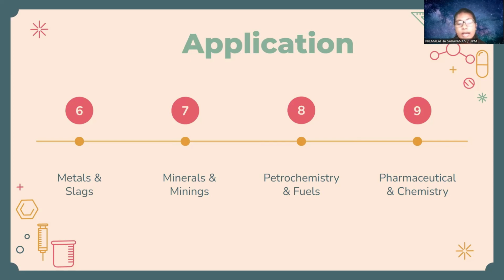Overall, XRF spectrometer, whether it's WD-XRF or ED-XRF, analyzes the bulk chemicals of major elements and trace elements in rock, sediments, metals, fuels, and in the elements which are used in the industries.